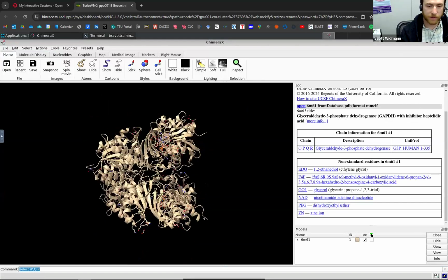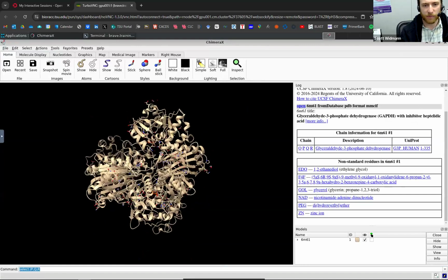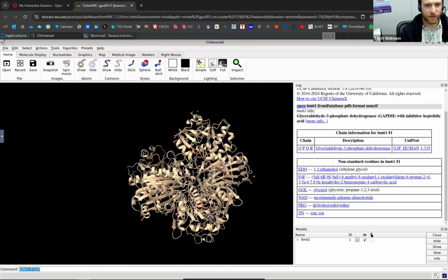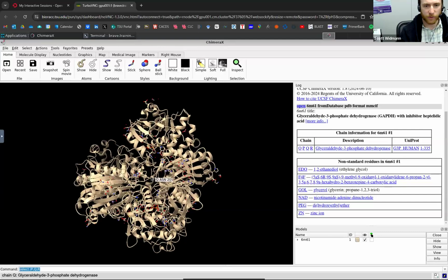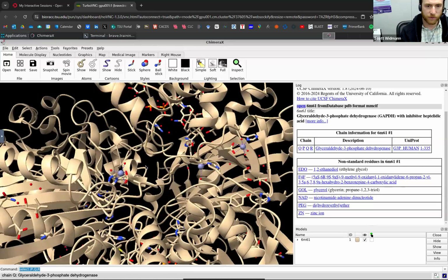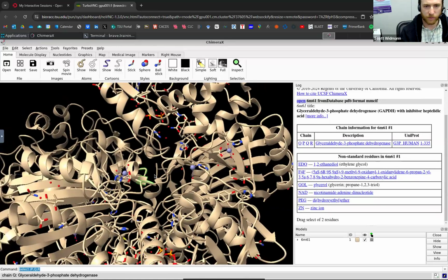I'm using my left mouse button to rotate, right mouse button to strafe left, right, up, down. Zoom using my wheel. Let me see if Control works. So as far as without a wheel, I'm sure there's a way to do it.